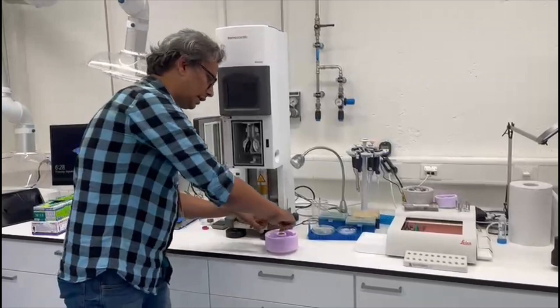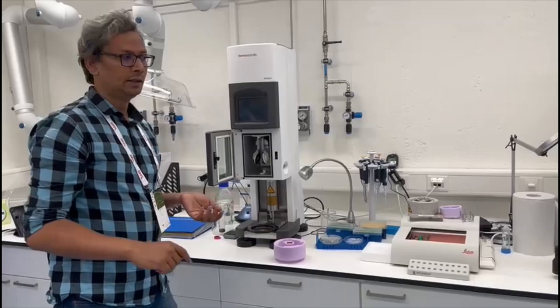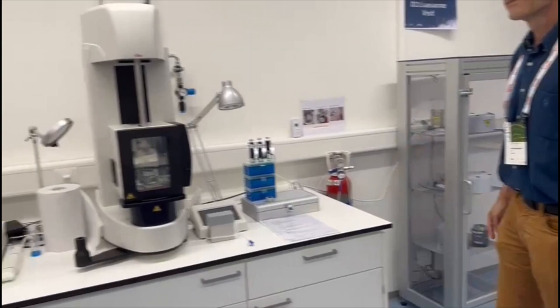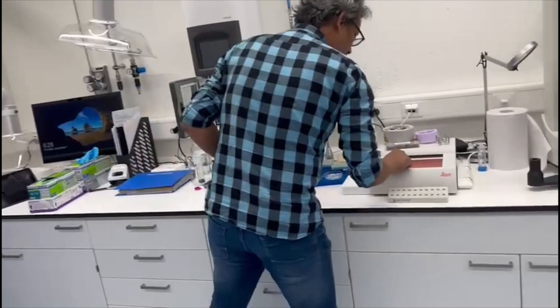It is liquid nitrogen surrounding the cup. Once it reaches minus 180, then you have the gas here, and you will condense the gas from the gaseous ethane to liquid ethane.